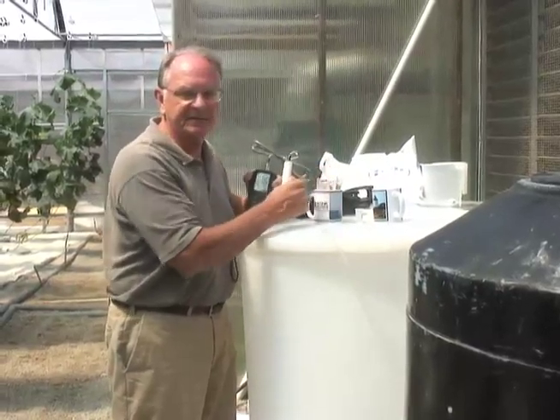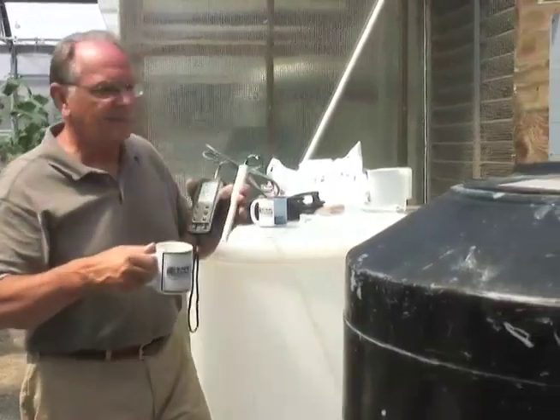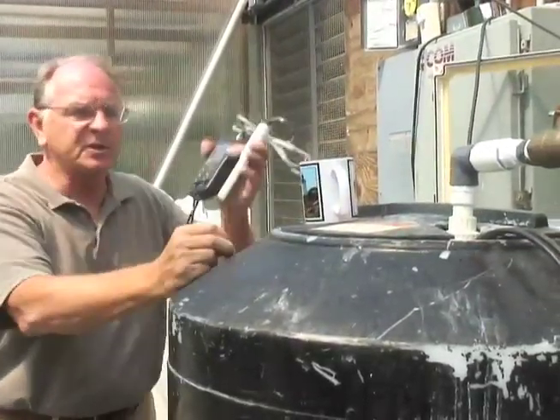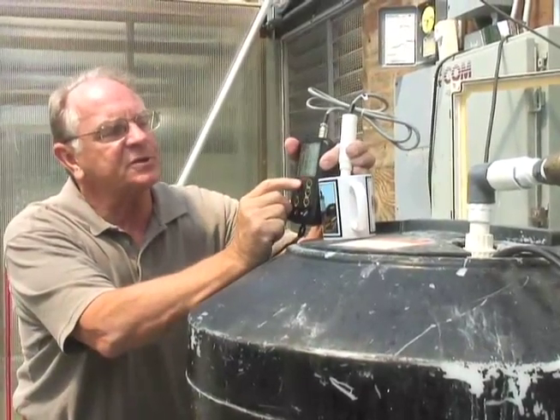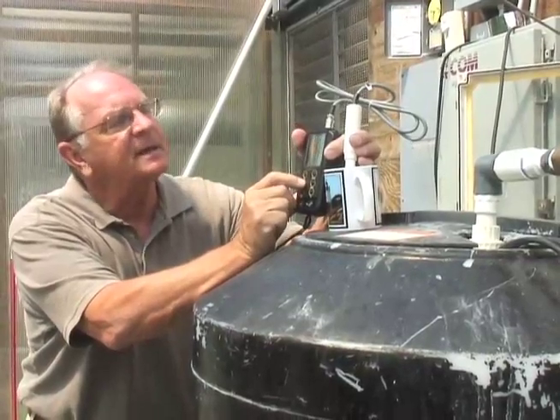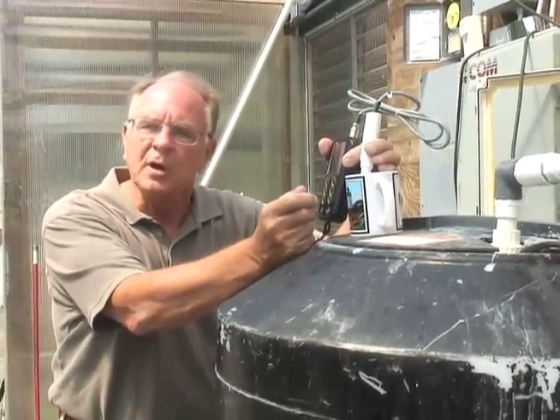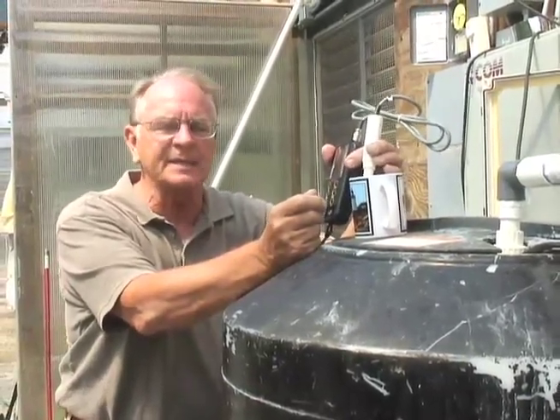Now we can do some tests. We have several ways of testing. We can take a cup, dip it into our solution, and then test the cup. Push it to pH mode to measure pH, then switch to millisiemens mode to get the EC reading. This one is running around 2 millisiemens and a pH of around 6.0, which is really ideal.